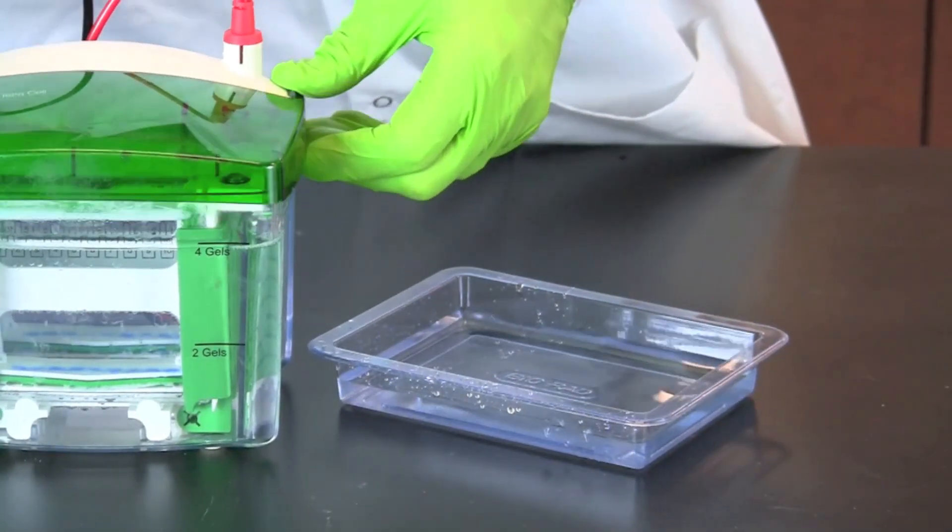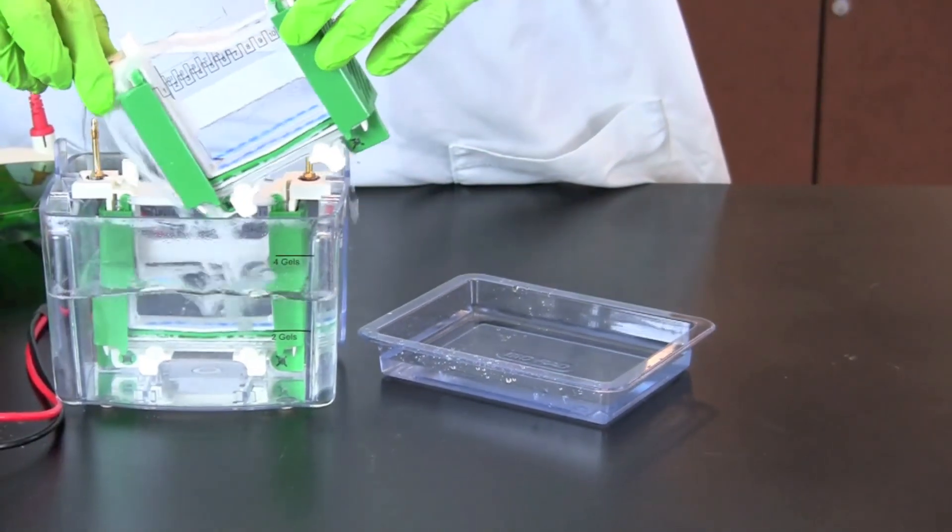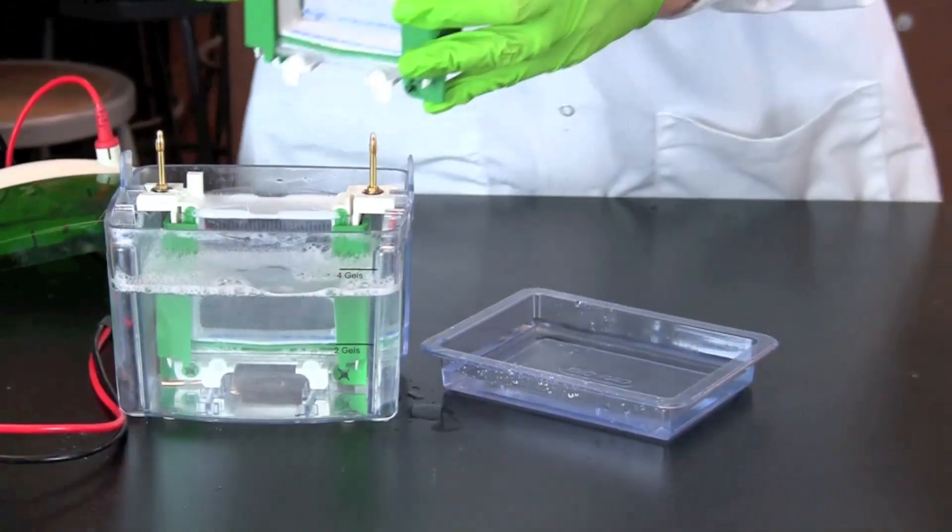When the electrophoresis is complete, turn off the power and remove the lid from the chamber. Remove the electrode assembly and pour the buffer from the inner chamber back into the tank.